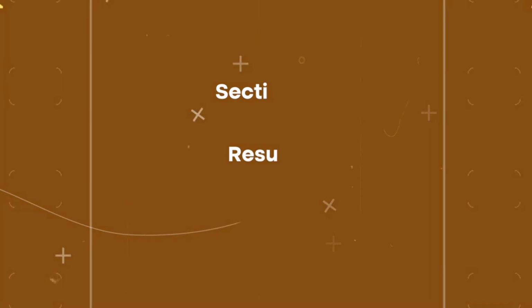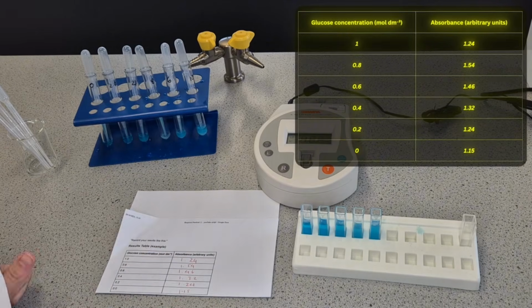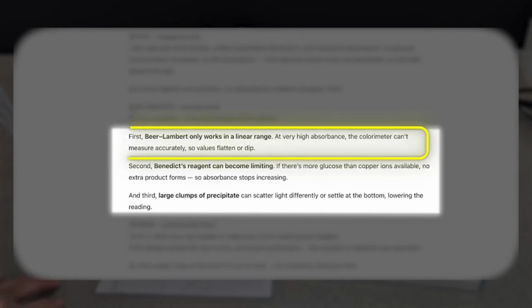1.24. So we can see that we do get this nice increase up until the 1.24 where it drops. So as we saw, the absorbance actually dropped when it got to the highest concentration. So I then went away and did some research, and here are some of the reasons why. First of all, it could be the Beer-Lambert law that only works in a linear range. So at very high absorbances, the colorimeter can't measure accurately, so the values flatten or even dip.